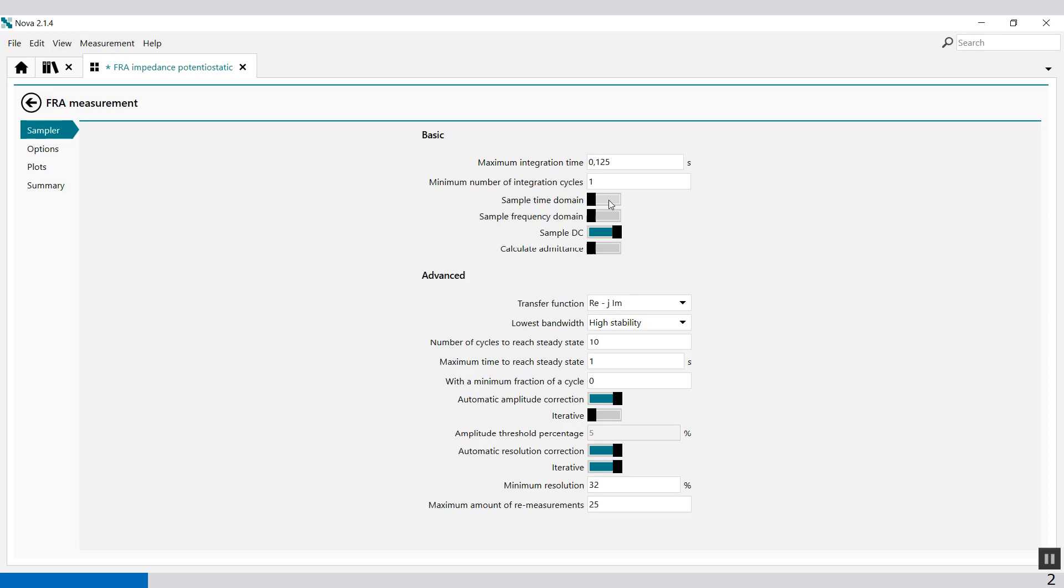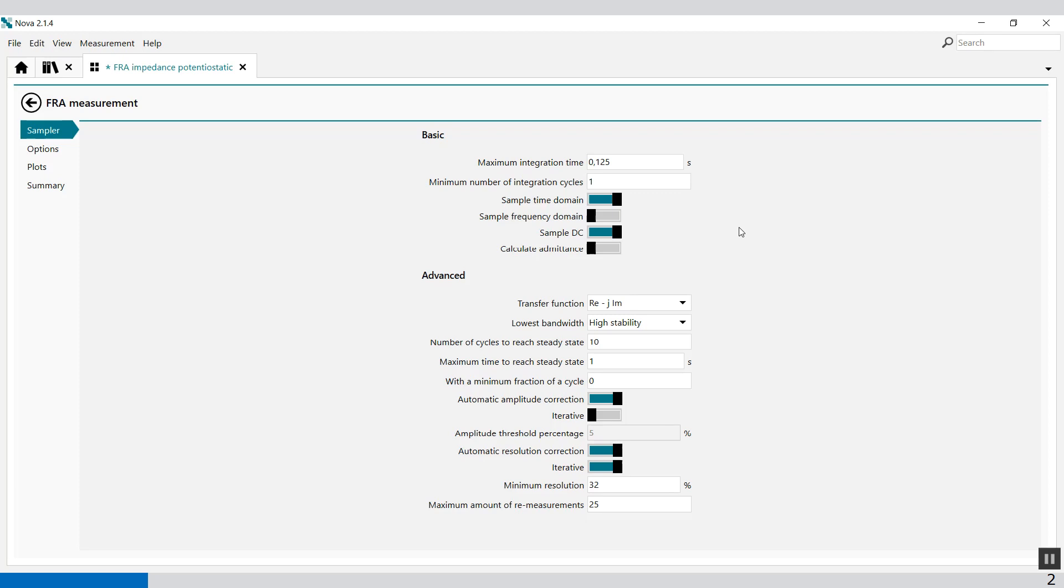You can also sample the time domain. This defines if the time domain information should be sampled during an FRA measurement using the provided toggle. The time domain information consists of the raw potential and current sine waves. This information can be used to build a Lissajous plot or to evaluate the signal-to-noise ratio and to verify the linearity of the cell response. The time domain potential AC and current AC and potential resolution and current resolution signals are added to the data for each individual frequency when this option is ON.